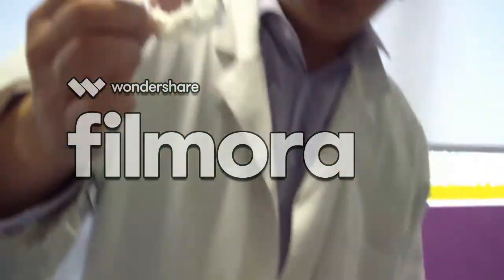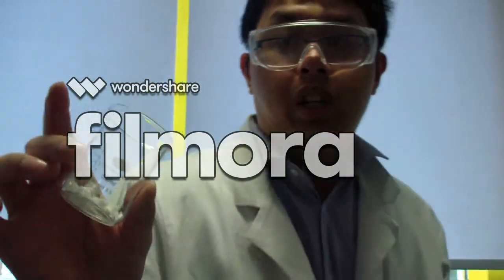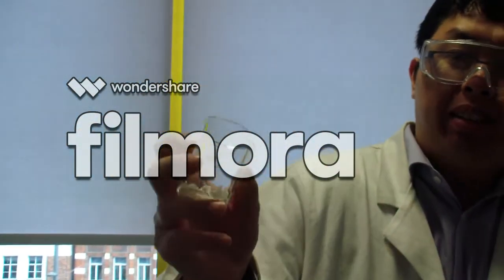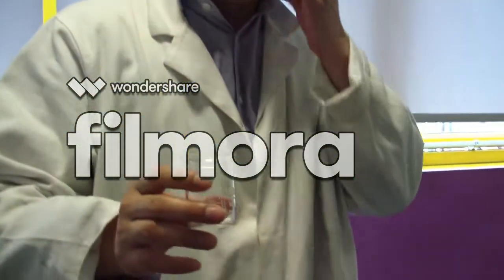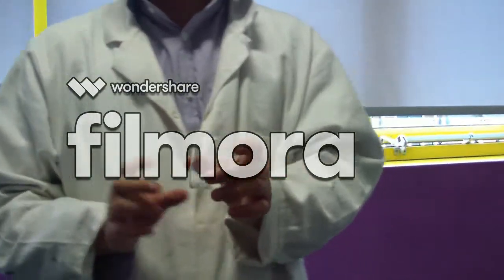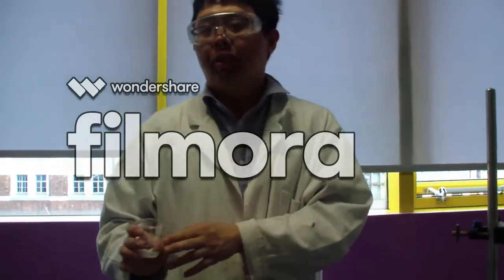As you can see, the solid is quite wet and it's still very impure, maybe from the sodium hydroxide or the ethanol that might still be remaining. And then we need to recrystallize it, which is in part B. But this is the end of part A for the preparation of benzoic acid.